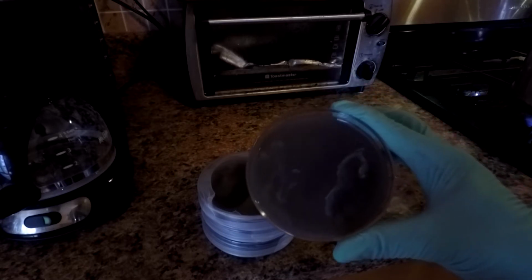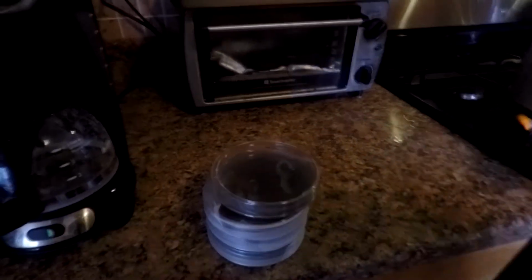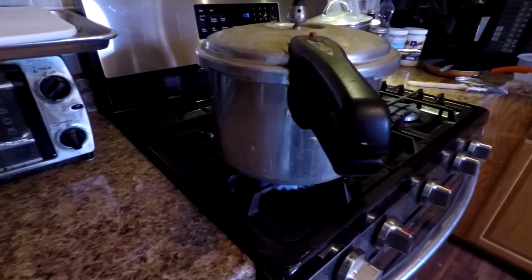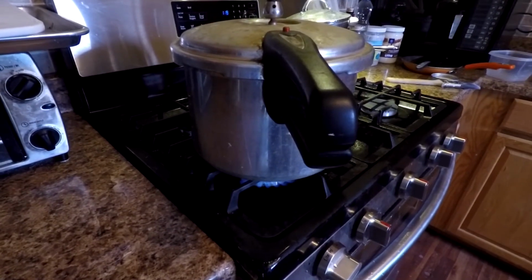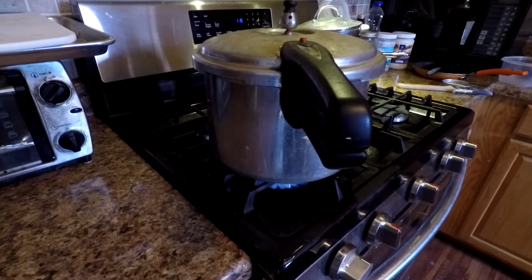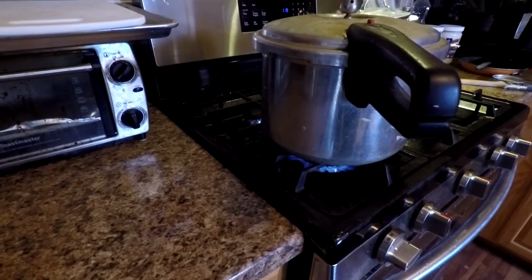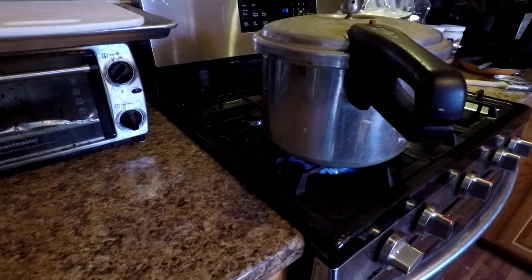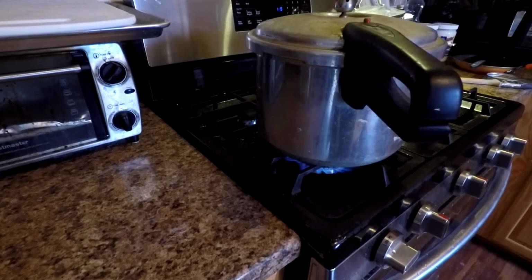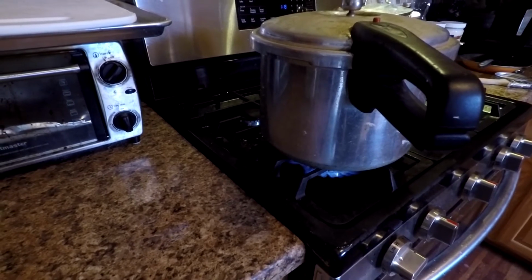So what I have to do is thin them out. And to do that, I got a pressure cooker going of just a small jar of water, about a cup's worth. I'll cook that for about 45 minutes once it comes up to pressure. And then once that cools, I'm going to use a couple drops of the spore syringe in that glass, thin it out, and draw it up with another syringe to get a less dense spread of spores on the agar plate.